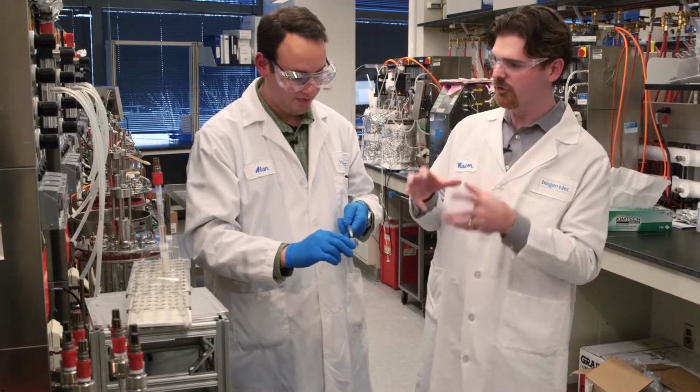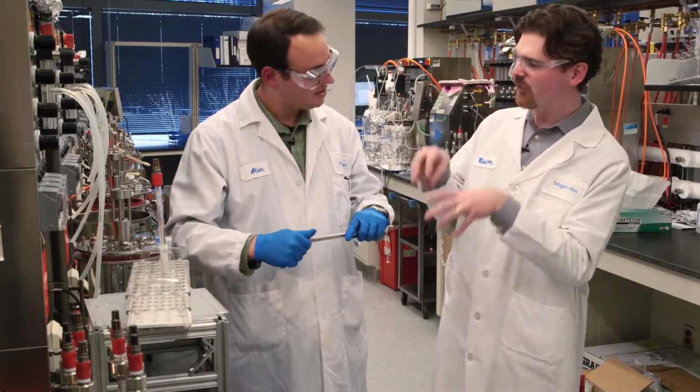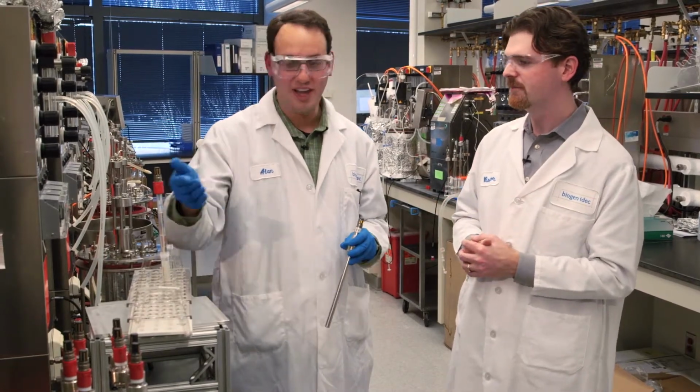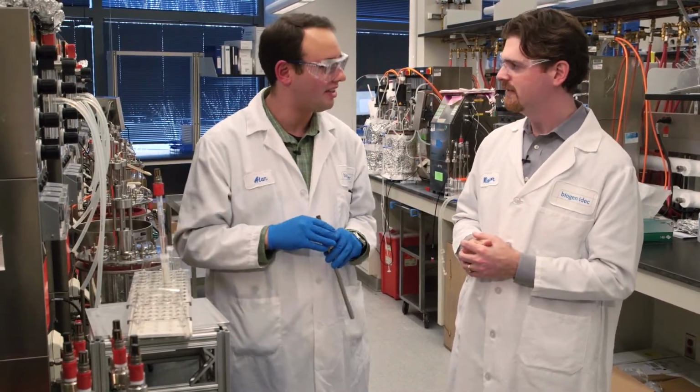Okay. And so then you would take both of these two probes, put them into the reactor, and that whole system we would go and sterilize. Exactly. So these are the last two missing parts that just have to be put into the reactor. Tell me a little bit about how we actually set up the system to go.